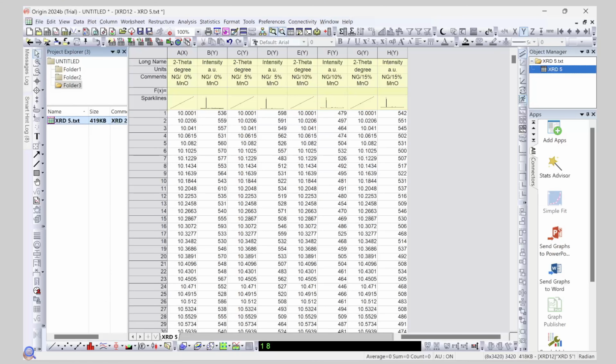So I'll click here and rename. We can double click on this and then a rename option will come, or you can right click and then rename. I'm going to give text XRD to faith. So this will be my title of the worksheet, because it is better that you keep renaming the worksheet so it is easy for you to come and look back again. So just don't leave it as it is, because the file name is different and what you have compiled is different. So always rename whenever it is possible.